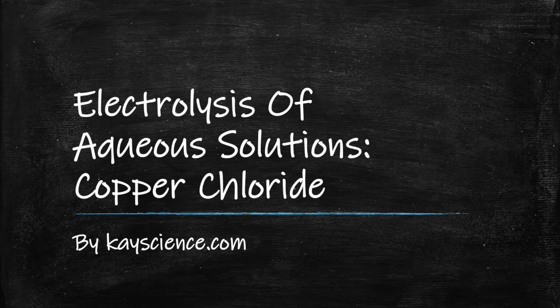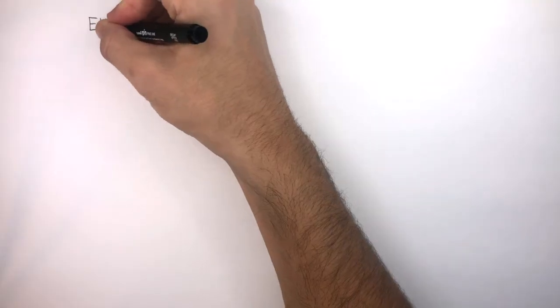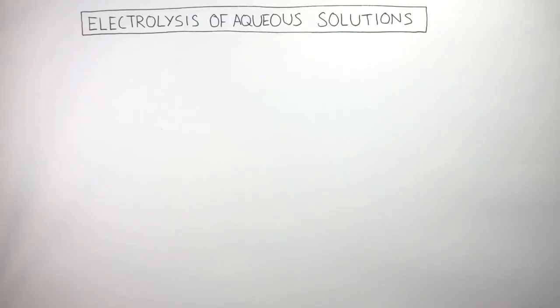Electrolysis of aqueous solutions, copper chloride, by KayScience.com. In this video, we're going to learn about the electrolysis of aqueous solutions using copper chloride as an example.